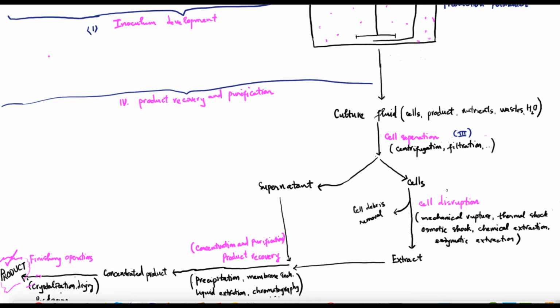Now, for an intracellular product, the product which is kept inside the microbial cells, the next thing we need to do is to break the cells to release the product out of them.